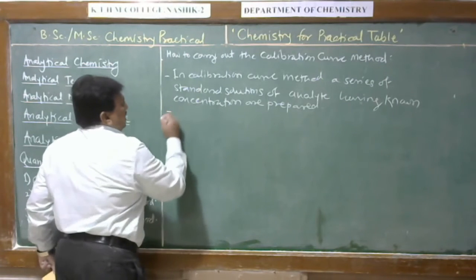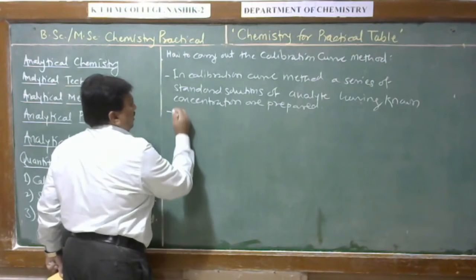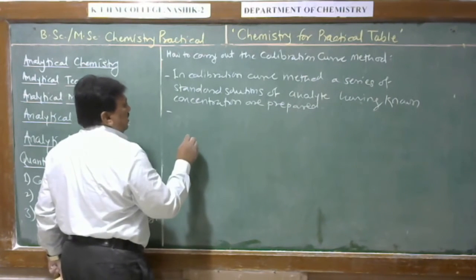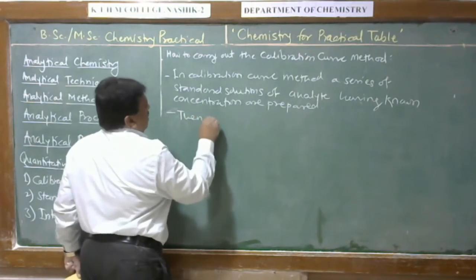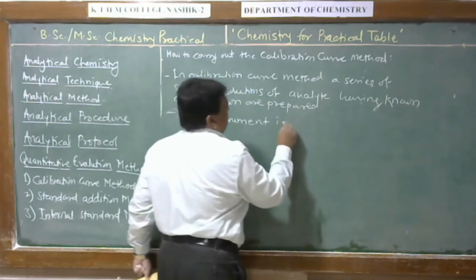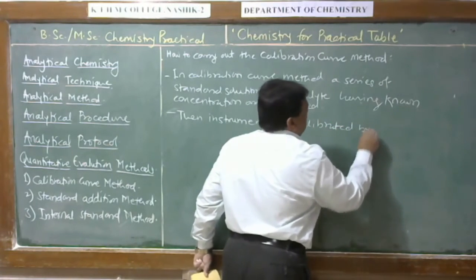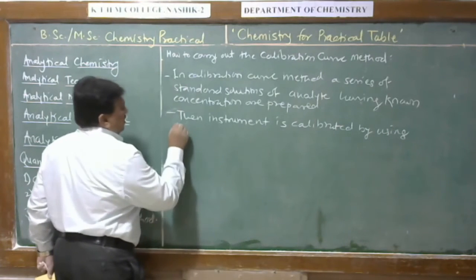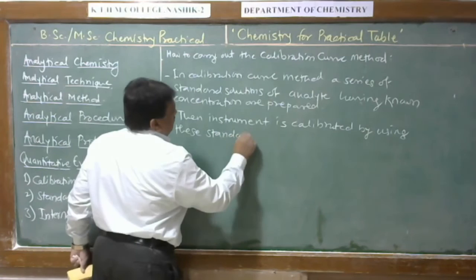Second thing is that during the calibration, the instrument is calibrated by using these standard solutions.